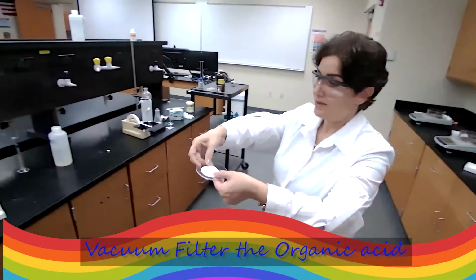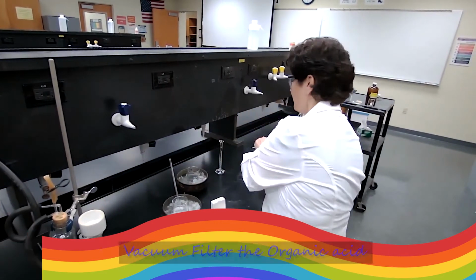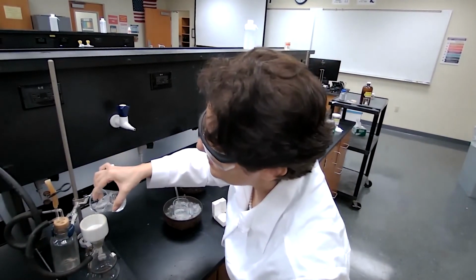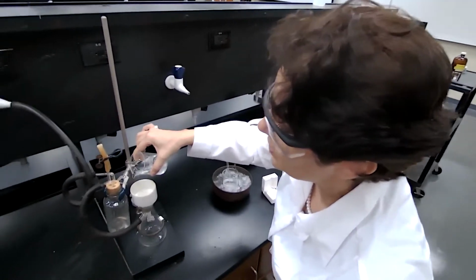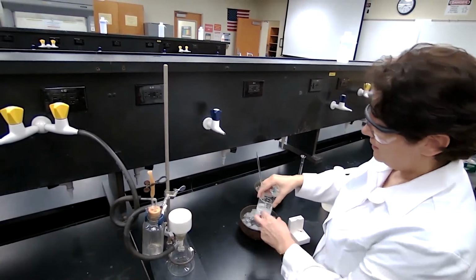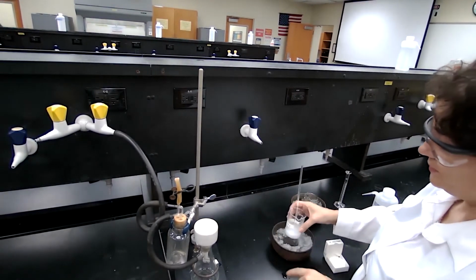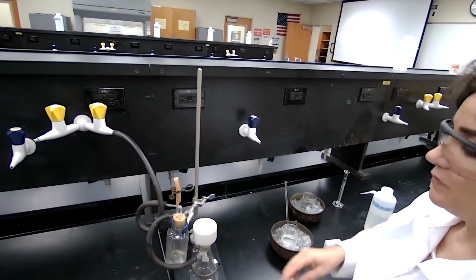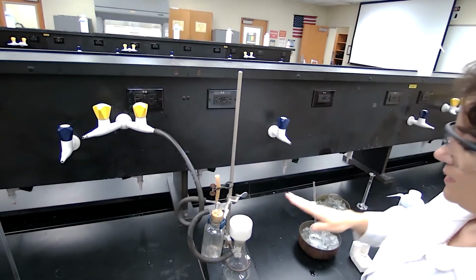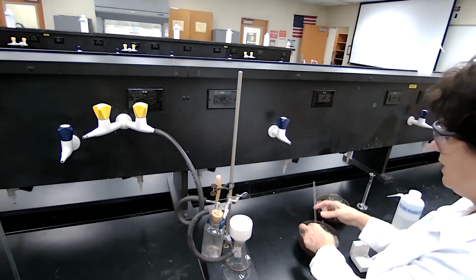We place this pre-weighed filter paper in the Buchner funnel and add a few drops of cold solvent, a few drops of water in this case, because our solvent or washing solution is going to be water. Then transfer the mixture. In order to transfer the mixture into the Buchner funnel, I make sure the vacuum is on. So I turn on the vacuum. If you can hear this fizzing sound, it means the vacuum is on.